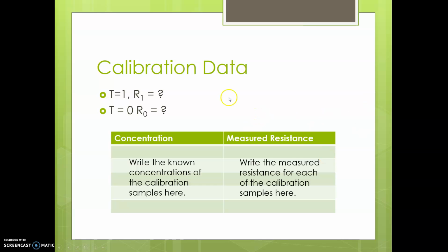So we'll have you guys be building this, and we'll have you build a photoresistor and then grow some algae and test its concentration.